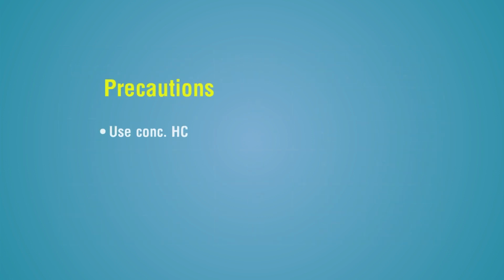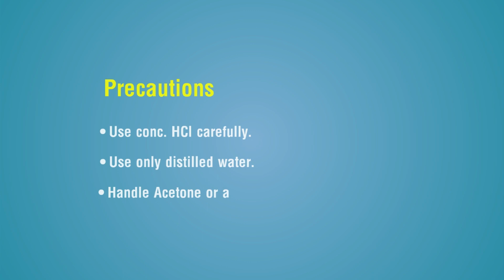Precautions: use concentrated HCl carefully. Use only distilled water. Handle acetone or alcohol with care since it is flammable.